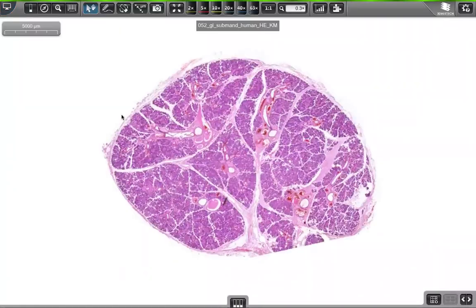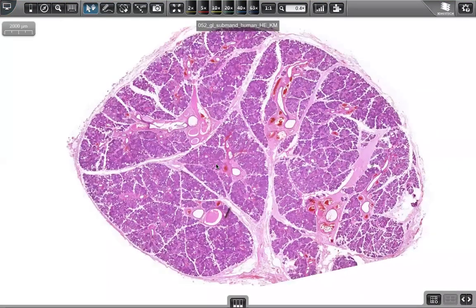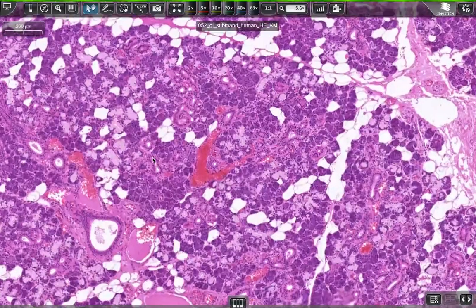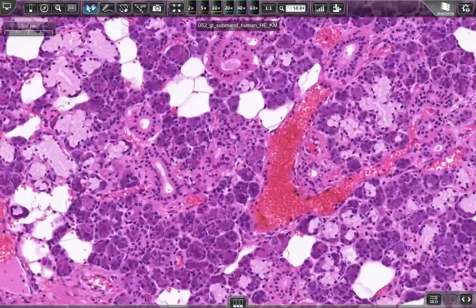You know, also frequently asked are the glands, the acini. So here we have the submandibular gland. It's a mixed gland having serous and mucous acini, but in the submandibular gland the serous acini predominate. We have connective tissue septa dividing the gland into lobes, and from the walls of the lobes we have small structures called lobules. So let's see them.